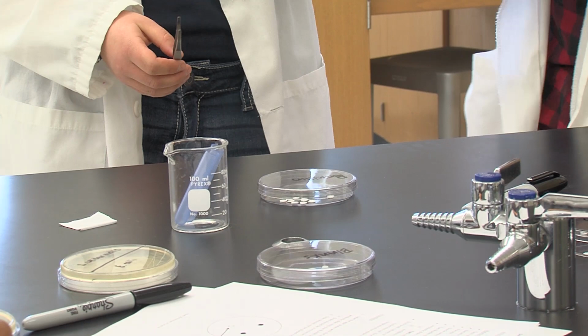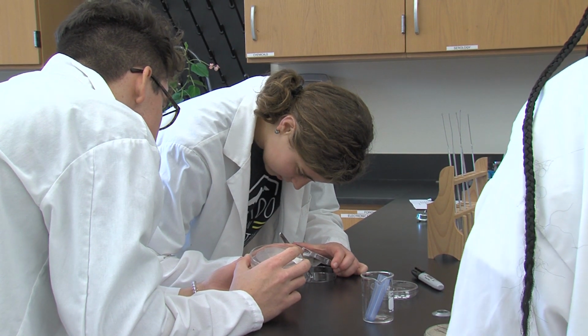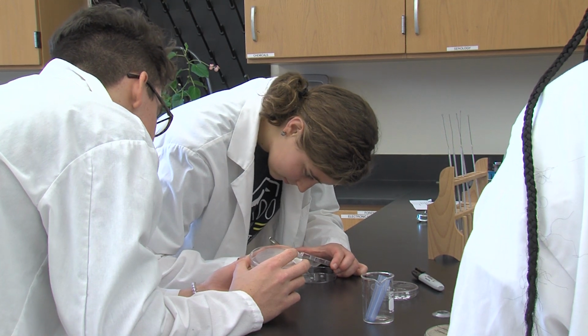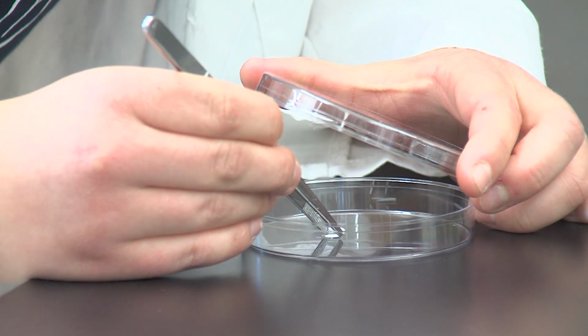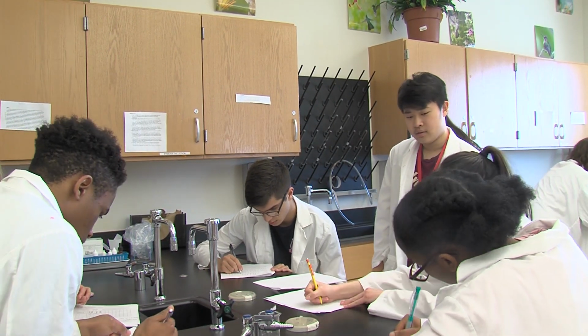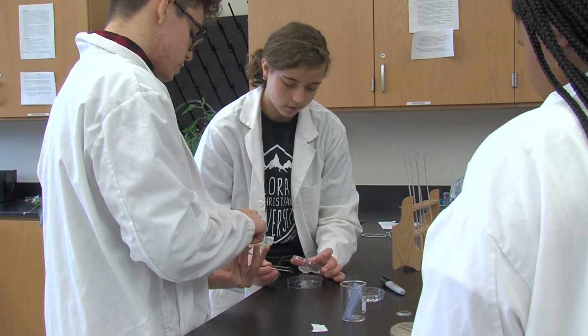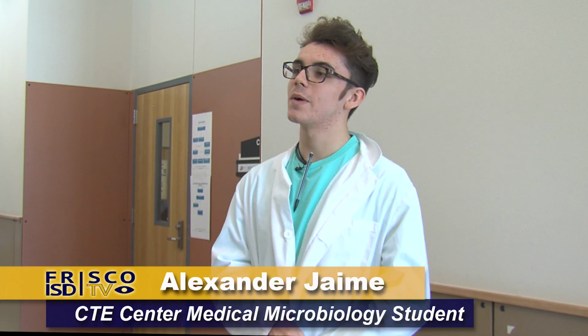Students applied knowledge from previous lessons to gain new experiences. So all of the stuff that we did in our past labs, such as aseptic technique and how to inoculate a plate, we got to use it in this lab in a way that's more practical than the basics. It was more akin to what being an actual microbiologist is like. To work with bacteria such as E. coli or S. epidermidis is something that not many people around the country and the state get to do.